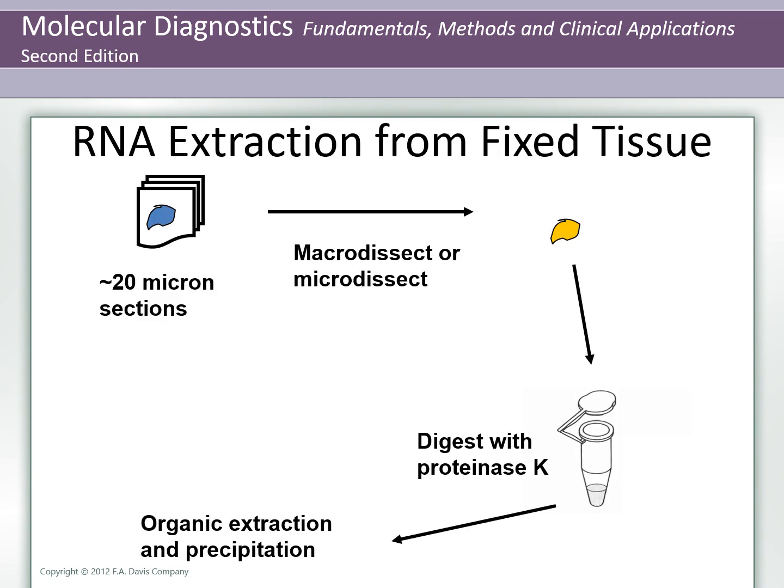The quality of RNA from fixed paraffin-embedded tissue depends on the fixation process and handling of the specimen before fixation. Commercial reagents are designed to provide lysis and incubation conditions that reverse formaldehyde modification of RNA and efficiently release RNA from tissue sections while avoiding further RNA degradation.